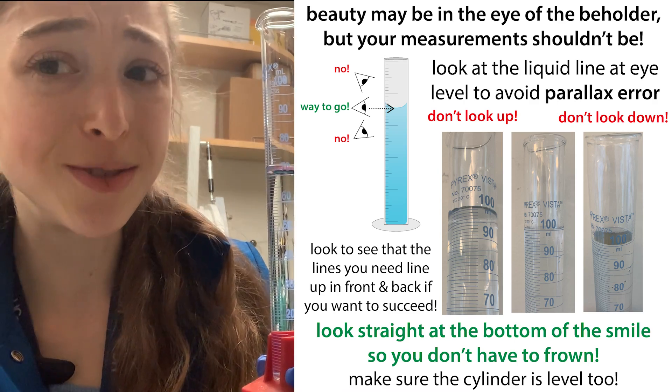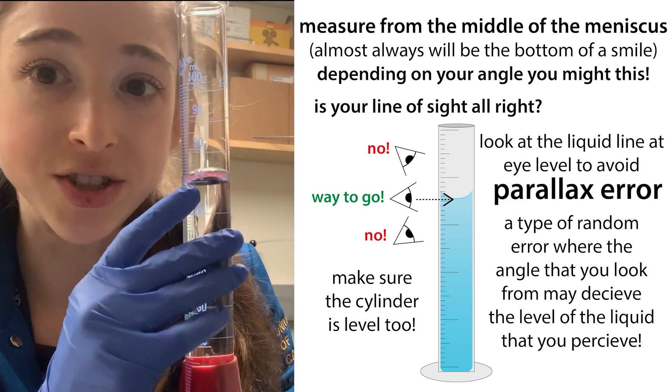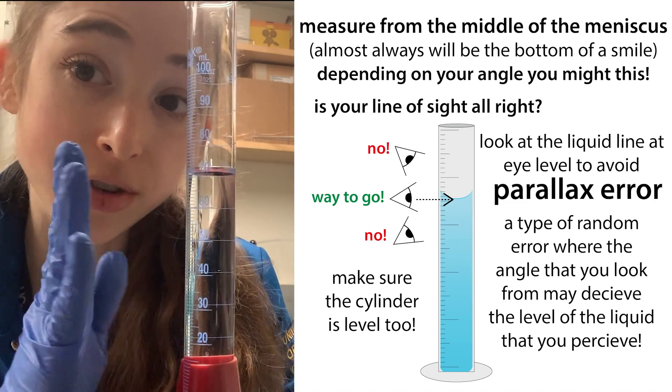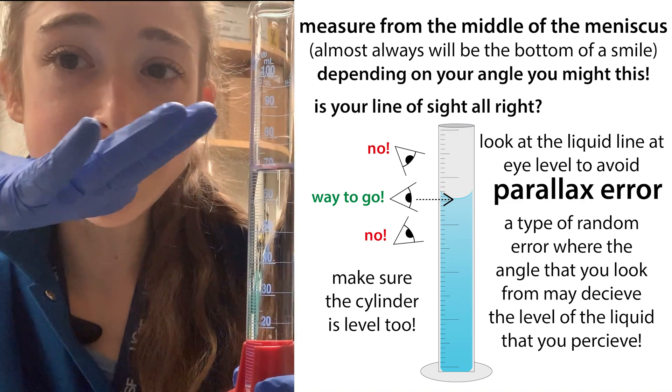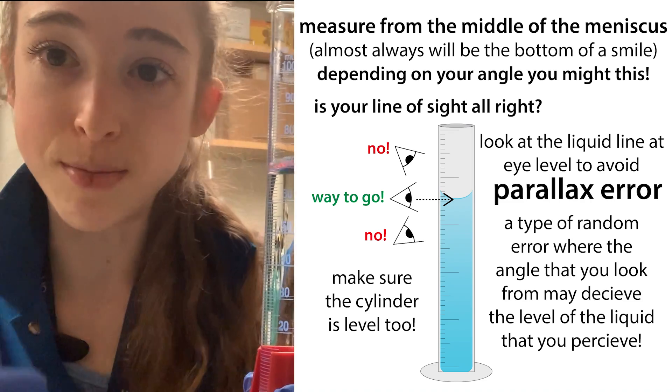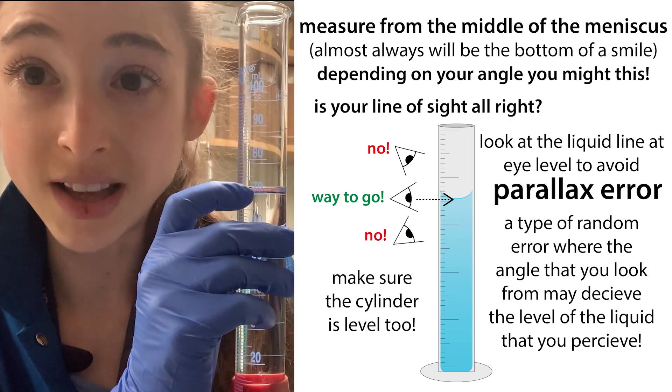Don't get lax when making measurements, or else you have to deal with parallax error. Basically, when you make a measurement of a liquid, you want to measure from the center of the meniscus. And unless you're dealing with mercury, this is going to be like the bottom of a smile. You want to measure so that you're measuring where the bottom of that smile is on the line.